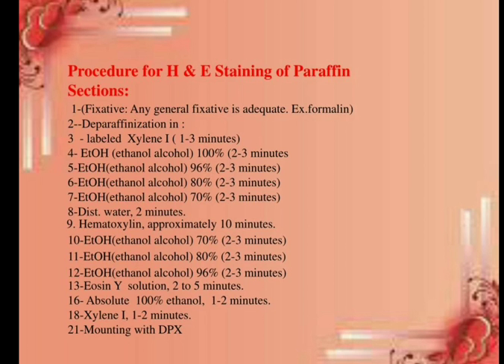This procedure of H&E staining of paraffin sections is different in various laboratories. The timing is different in different laboratories.